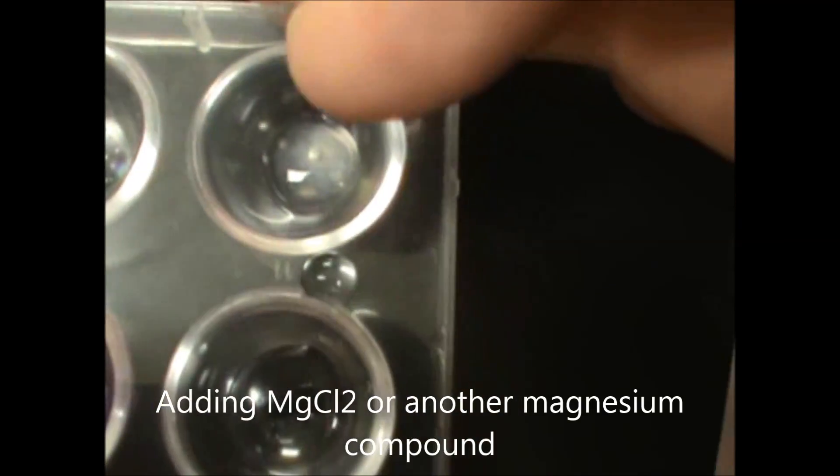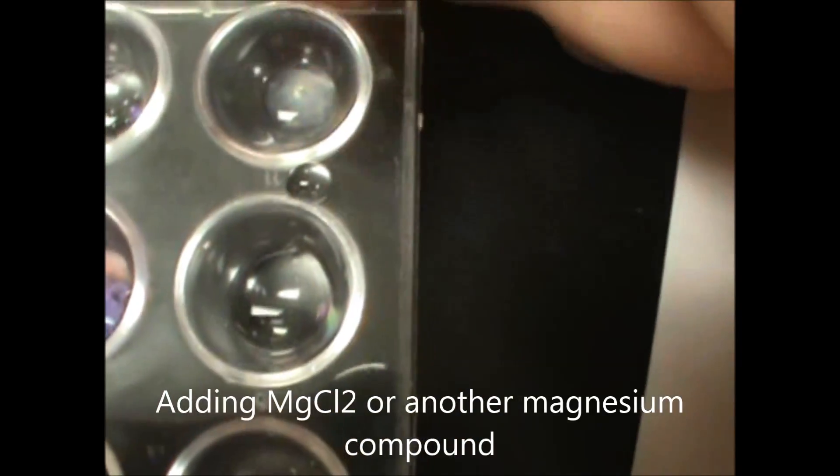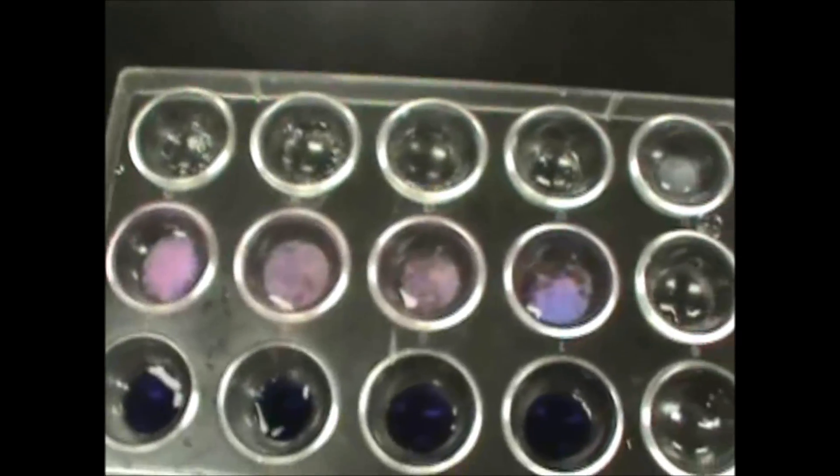So you can see that I have a precipitate here, but not here, and that allows me to tell this is a carbonate and this is a bicarbonate. Thank you so much.